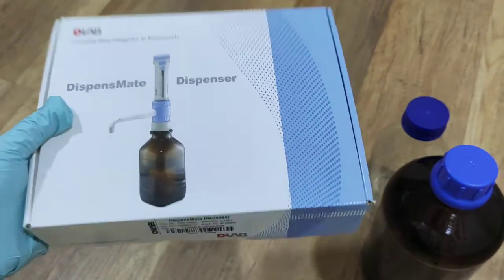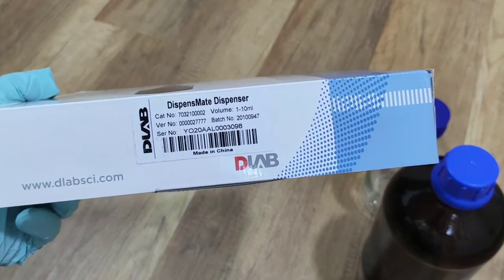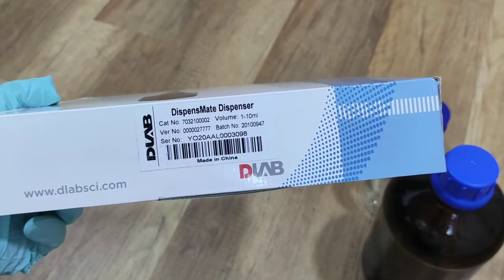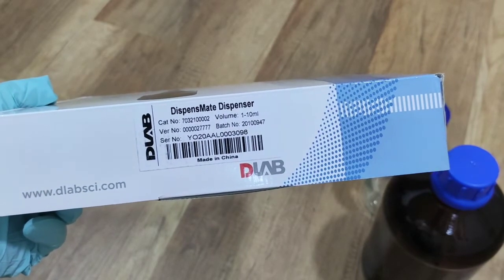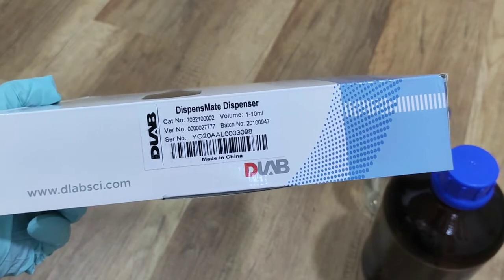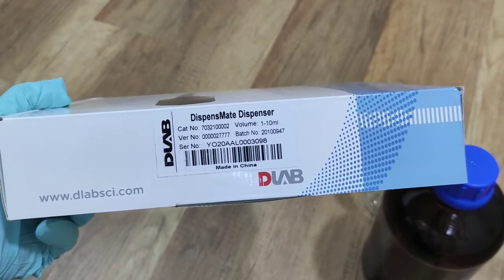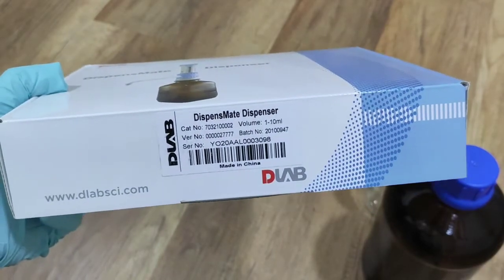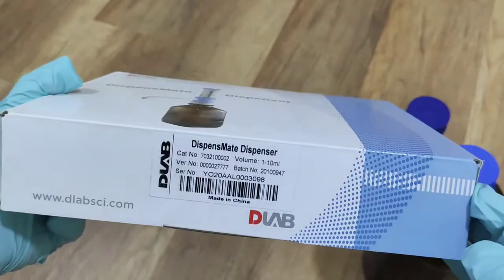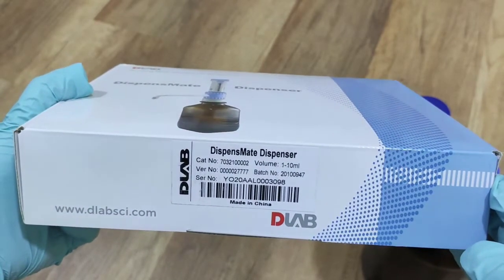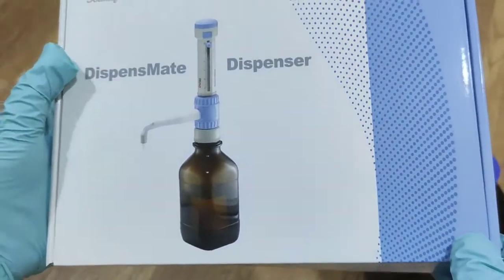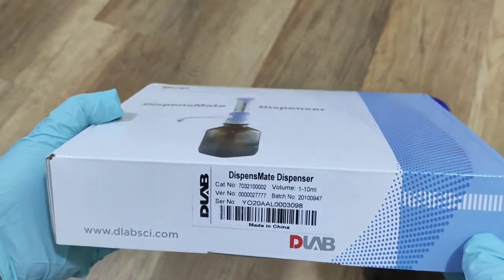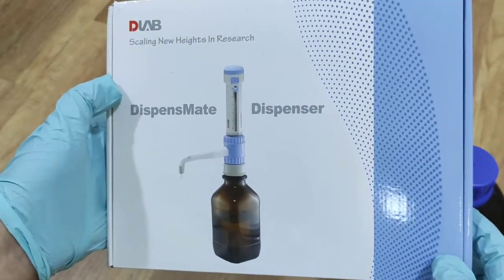This is the box and this dispenser has 1 to 10 ml capacity. The maximum is 10 ml, the minimum is 1 ml. There are many different kinds, different capacities for the dispenser. But today I'm going to show you only this 1 to 10 ml. Others are the same, only the same design, same manipulation, only the capacity is different. But when you know one kind, you know all.